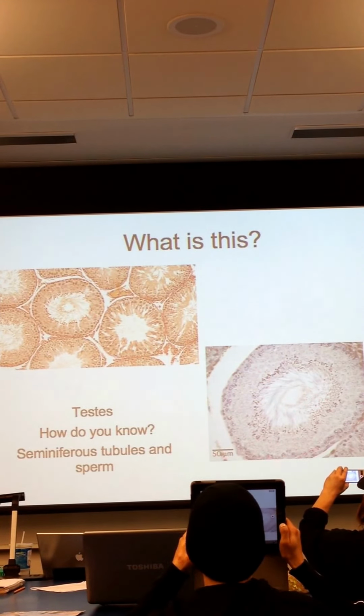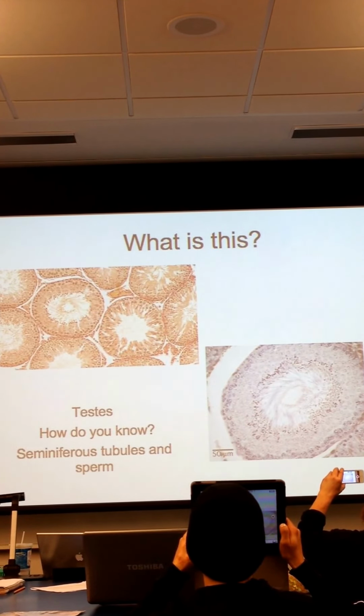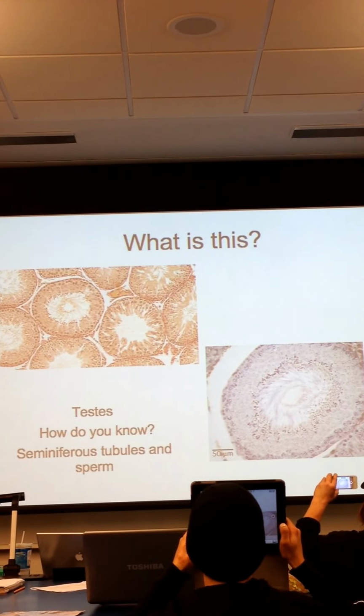So, these little cells around the outside, those are the seminiferous tubules. Okay, so that gives them a distinctive appearance. Then we have all this swirly stuff in the middle, which is the sperm. Okay? So very different from the cat ovary. Those are the two reproductive tissues you need to know, the cat ovary and the rat testes.